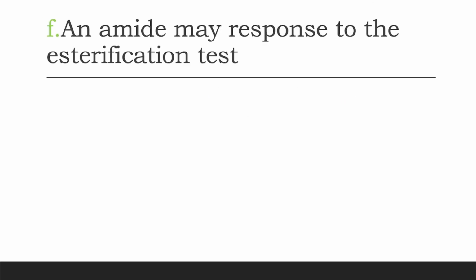Now, an amide may respond to the esterification test. Yes, this is quite interesting. An amide may respond to the esterification test, and that type of amide is salicylamide.